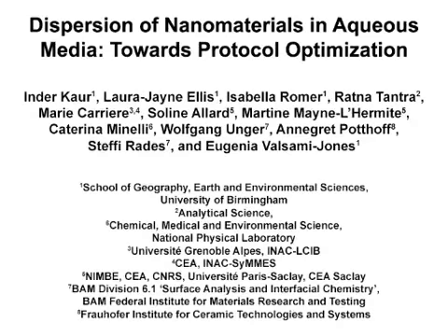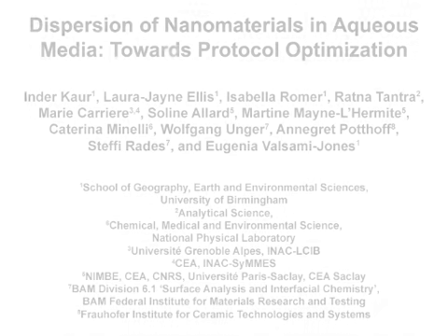The overall goal of this procedure is to use real-time characterization to identify the optimal sonication conditions, intensity, and duration for obtaining stable and uniform nanomaterial dispersions in aqueous media. This method can help answer key questions in nanoscience, particularly in the field of nanotoxicology, about how to optimize nanoparticle dispersion without impacting sample integrity.